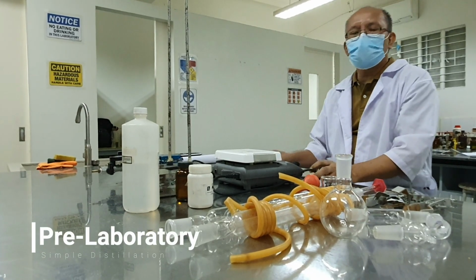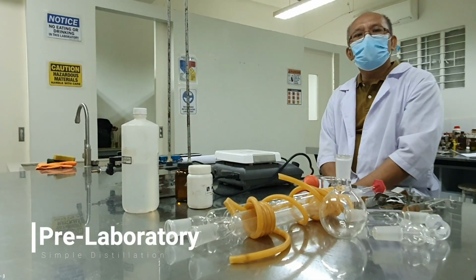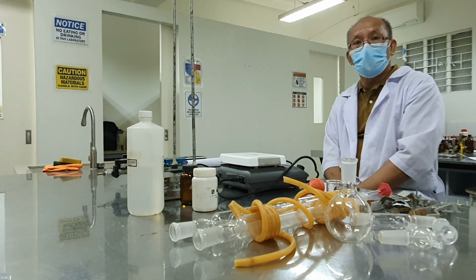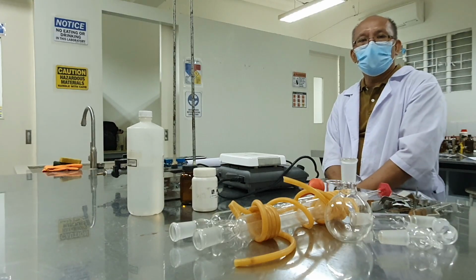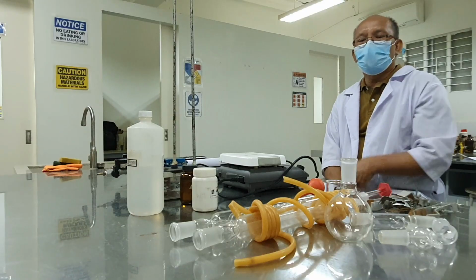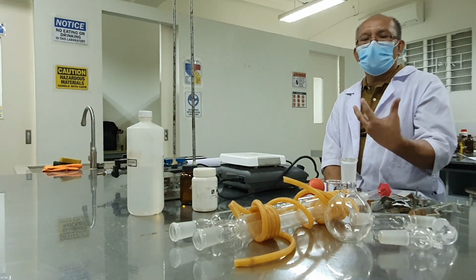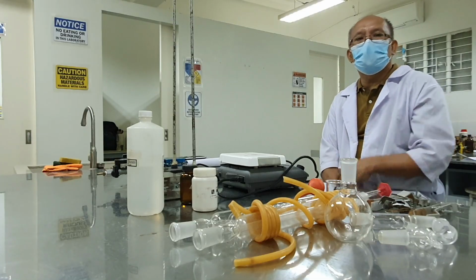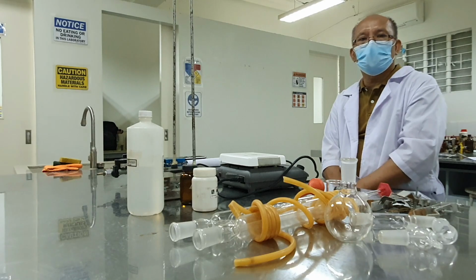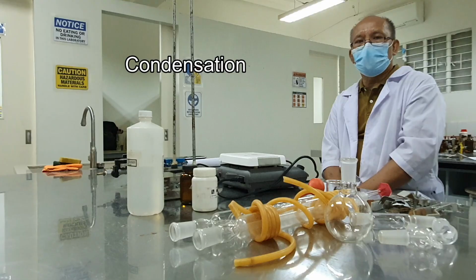Okay, so our next experiment class is distillation. Distillation is a physical process of separating liquids in a mixture, and the basis of separation is boiling point difference. If you have a mixture of liquids, the distillation process actually involves two physical methods of separation. First is evaporation, followed by condensation.